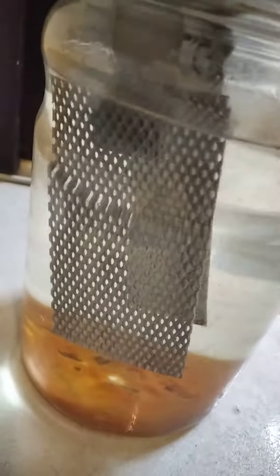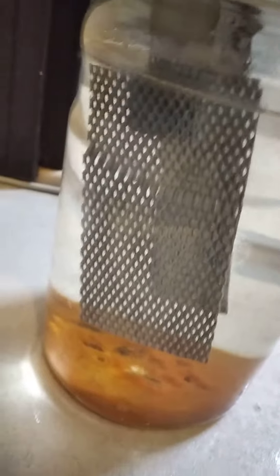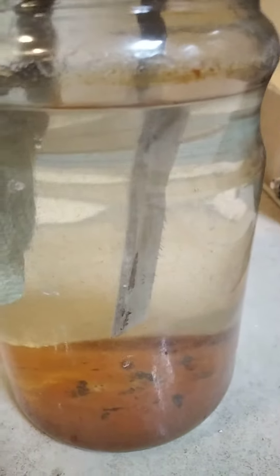This is my homemade antimony tin oxide electrode — well, it's not antimony, it's cerium tin oxide. There's a slight yellow color here, and it seems that it's working. I've got it hooked up as the anode.